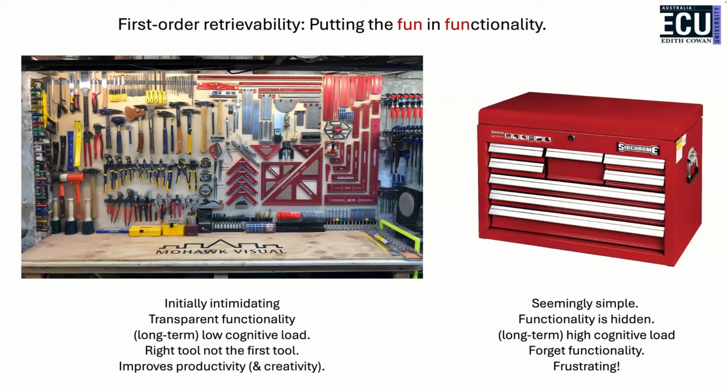On the right-hand side, it seems like it might be simple, but a lot of the functionality is hidden. This can lead to a high cognitive load if you don't use the software regularly. Then every time you use it, you have to relearn it. Certainly if it's command line and the options are just not easily accessible, you have to go and read some web page somewhere in a manual to type in extra options into a command line prompt. That's not very useful for somebody to play with the software and really try and learn how to use it on the fly. And it can get really frustrating.